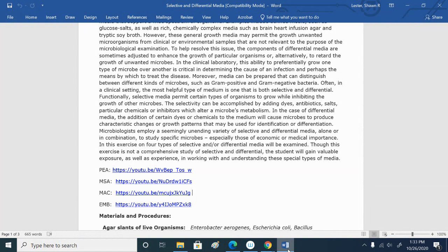We use them primarily for gram-negative rods because, as you recall, the enterics, one of the criteria to help distinguish the enterics was the ability to ferment lactose. So you can use either MAC or EMB, but as we'll see, MAC is more reliable and easier to interpret than EMB. But they both do the exact same things. They just have some different chemicals to produce some different colors.